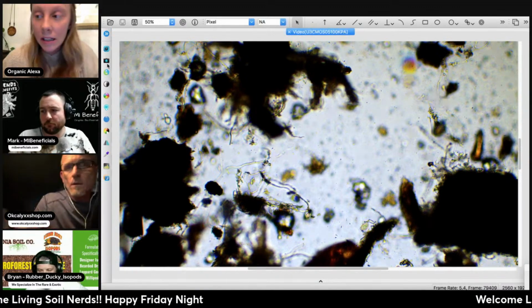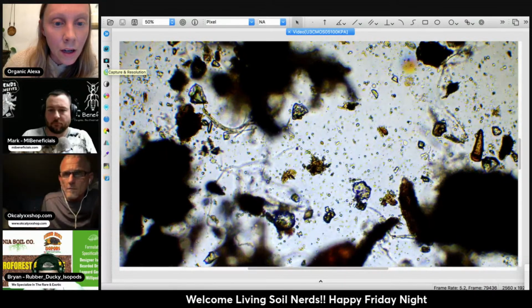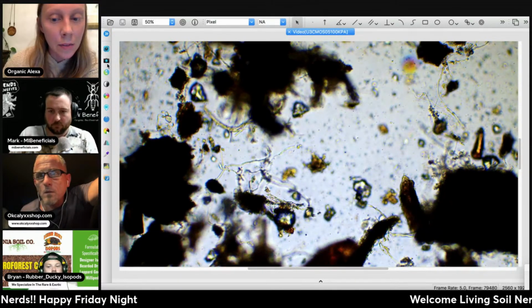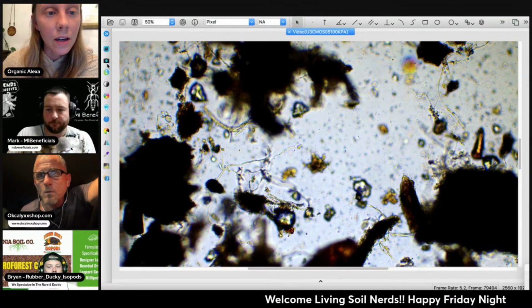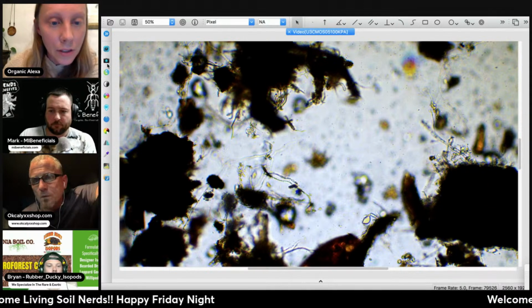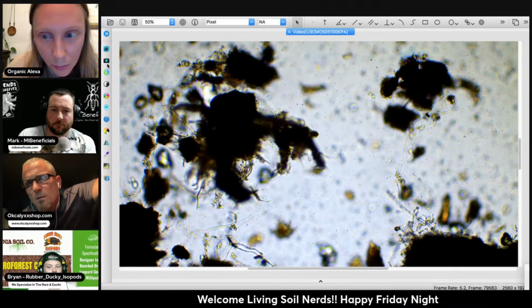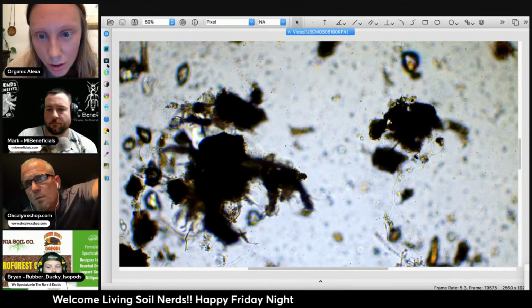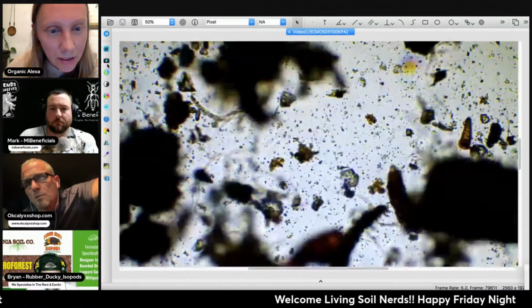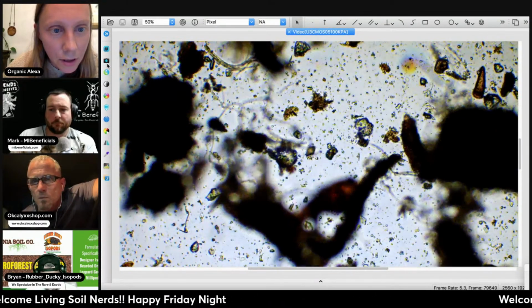Yeah, absolutely. So again, we're looking at these fungi here, and they could be ascomycota, they could be zygomycota, but just because they're not basidiomycetes, like the ones known to be the most beneficial, doesn't mean they aren't beneficial in the soil. And you can see here a lot of these have chlamydospores on them, which are types of spores that ascomycota and zygomycota primarily make to prevent them from drying out. It's made for survival.